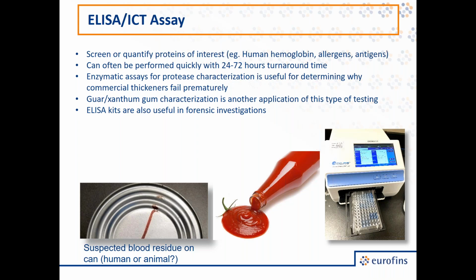They're also useful for determining, okay, gee, we know we have a blood spot. Well, is it human blood? There's animal blood. There's different guidelines for both of those.